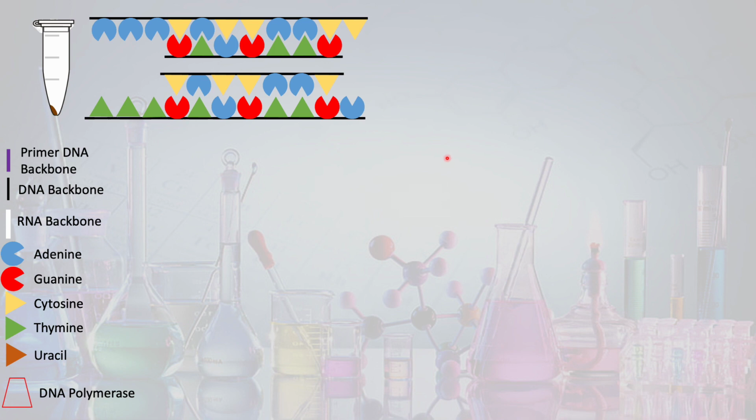So this week, we'll be designing our own primer sequences that will allow us to investigate genes of interest, right? Genes that we're interested in measuring whether their expression goes up, down, or doesn't change at all. In order to do this, we first have to design our own primers. And where we're going to do that will come up in a few slides.